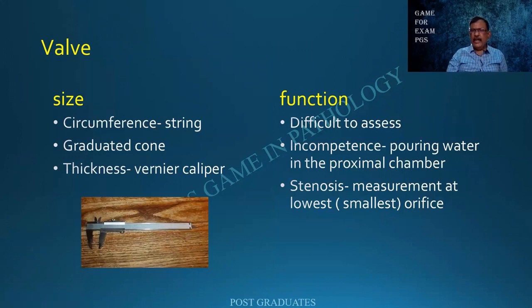And coming to the valves as such, measurement of the heart is one, measurement of the valve is another. A common question that is asked, and even otherwise it is common sense for us: how do you measure? It can be done by means of a string. You don't have any instrument in your center, just a piece of string which is around the valve. You will be able to get the circumference. Otherwise, there can be a graduated cone. As it goes deeper, you find according to the graduation, you will be able to make the measurement.